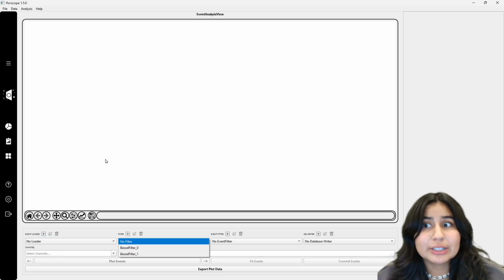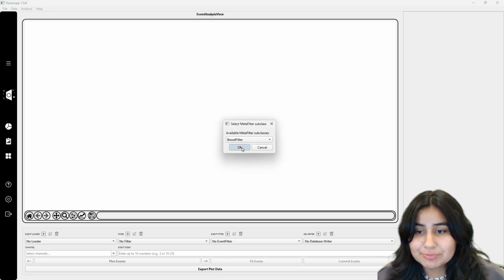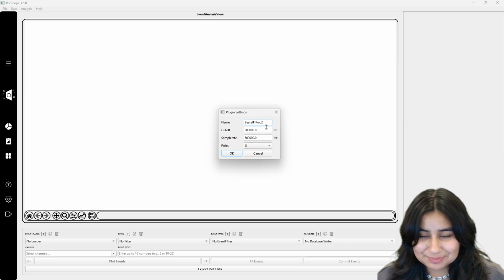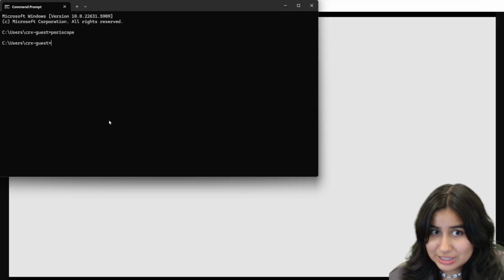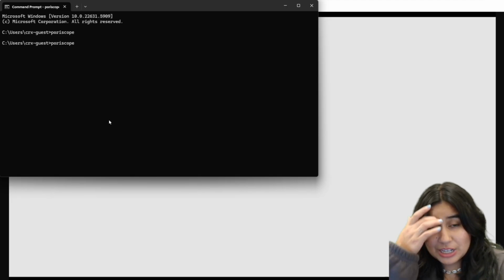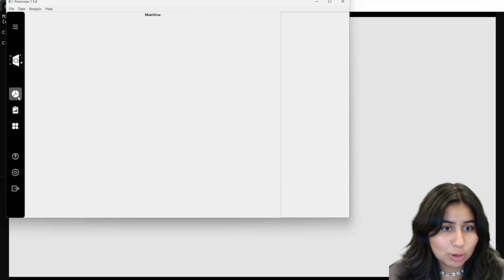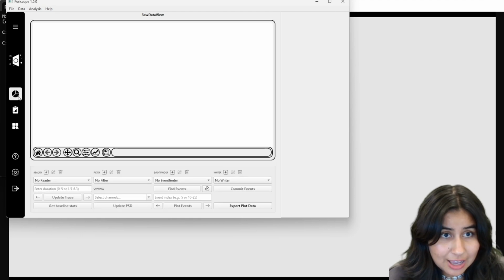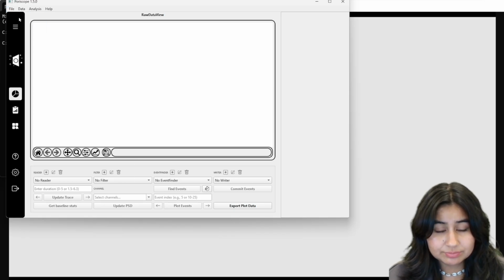It is really important to note that if I had done, for instance, I have filter here, I am gonna create a third one. So now I have 3 filters, then I close this, then I launch the application again. But I don't restore immediately. I go here and then I try to restore the session again.